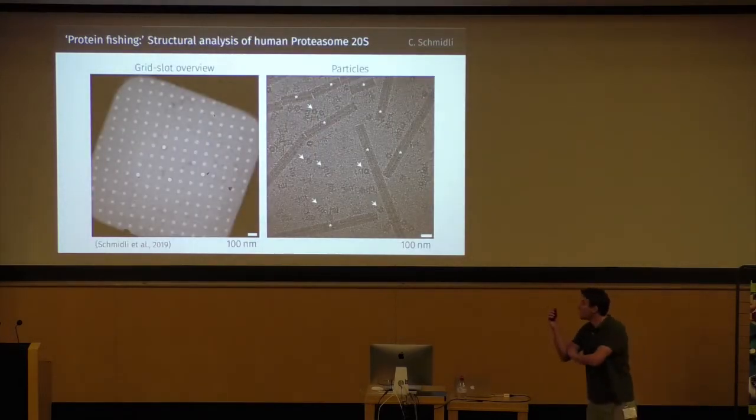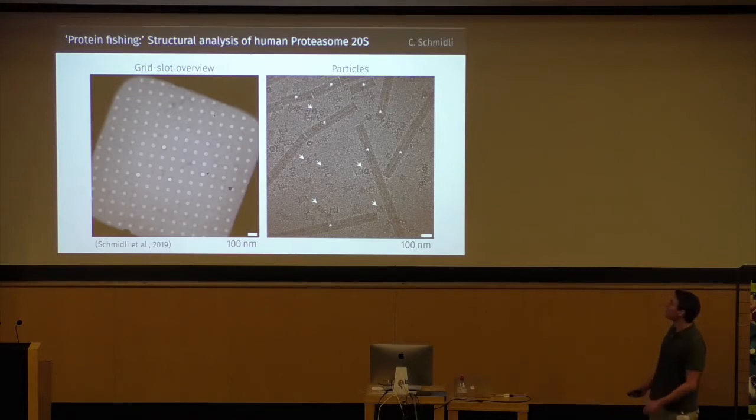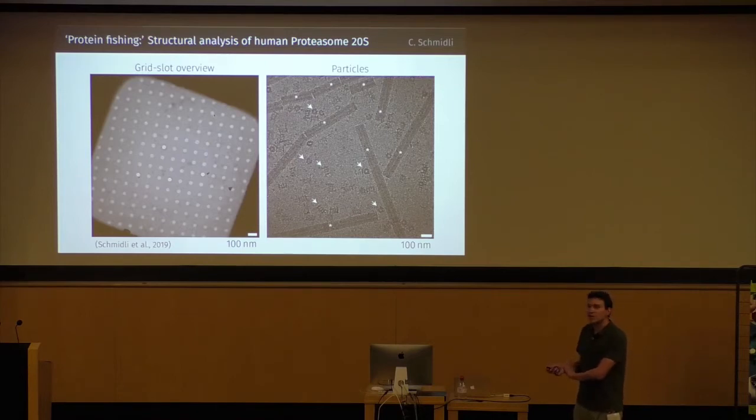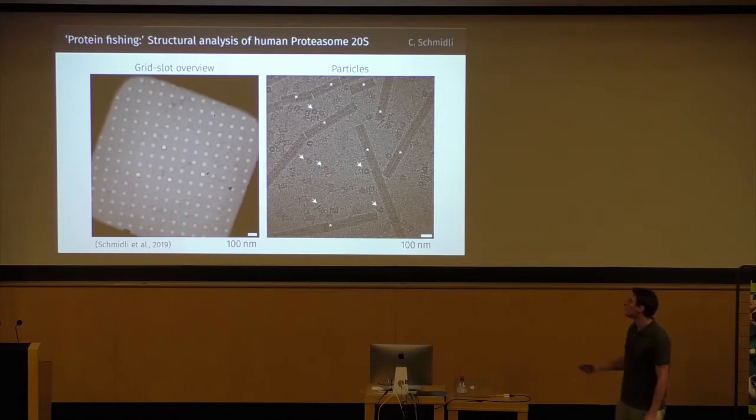Now this is a very interesting project from a former PhD student in our lab. He was buying commercially available HeLa cell lysate, and he was using 900 nanoliters of HeLa cell lysate as starting material. By using this trap, he was able to fish the endogenous native human 20S proteasome and make two grids. This is how one of the squares of this grid looked, and this is an example picture which was taken here.